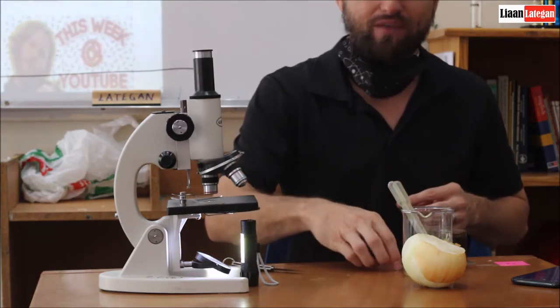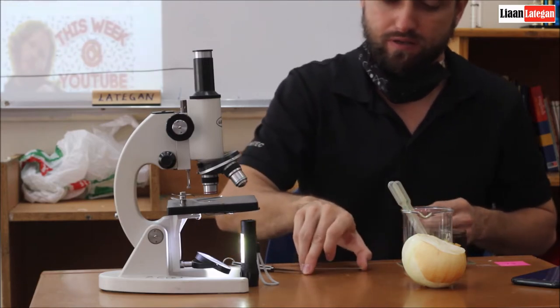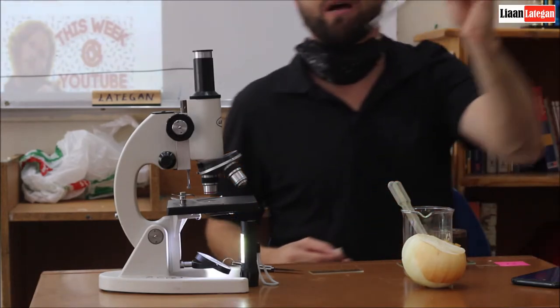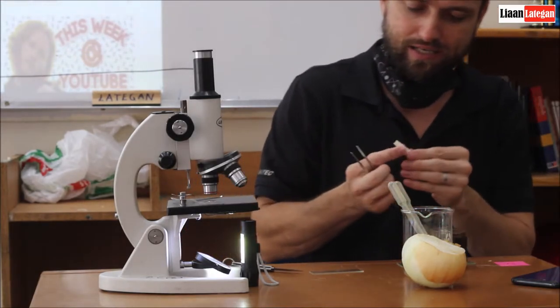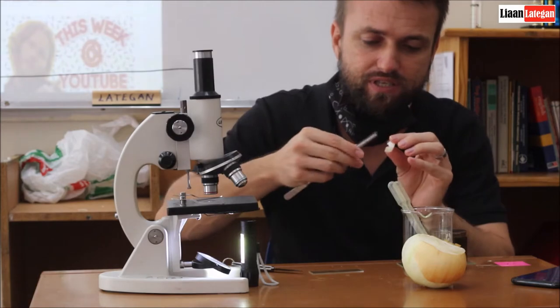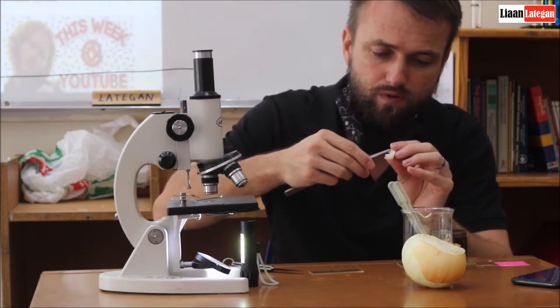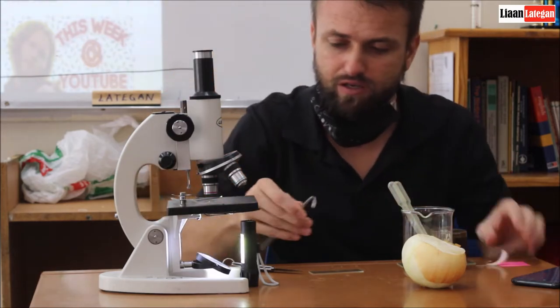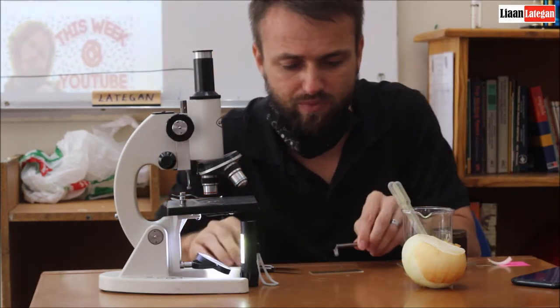Then we want to have a plate. And I just want to utilize my tongs so that I can easily get a piece of skin. That is a really good piece of skin that I got here from the onion.